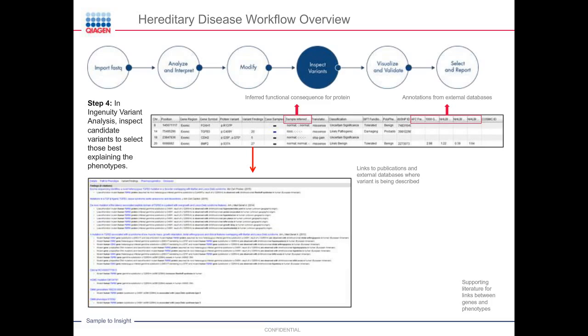If it was described in the literature, you get the link to the literature, but also a sentence which summarizes in what context the variant was identified, and with what kind of disease, if there's any. You also see what the functional impact could be. You see also a classification here, and you get information from population databases on how frequent it is in the population.